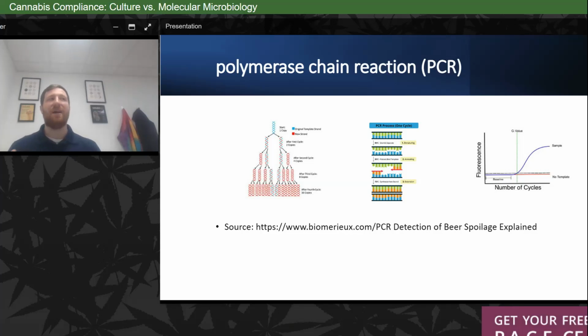Now, PCR occurs through a process of heating and cooling. The primers are extended on forward and reverse strands of the DNA. The probe is degraded as a result of polymerization, and the fluorescence signal is generated. We can see that fluorescence signal in the bottom right image, and that's where we see that beautiful logarithmic curve occurring, basically telling us that our target organism has been detected. That has been through amplification.